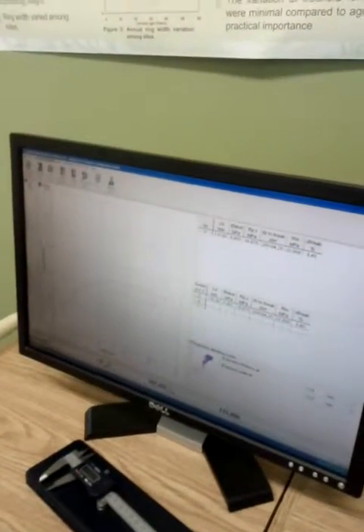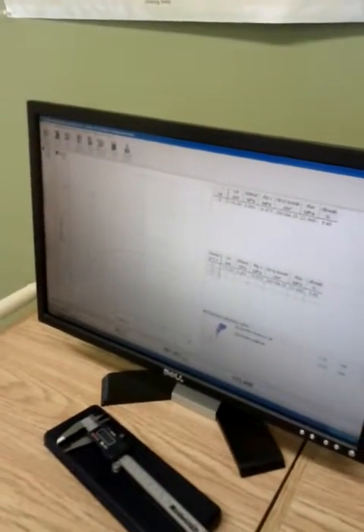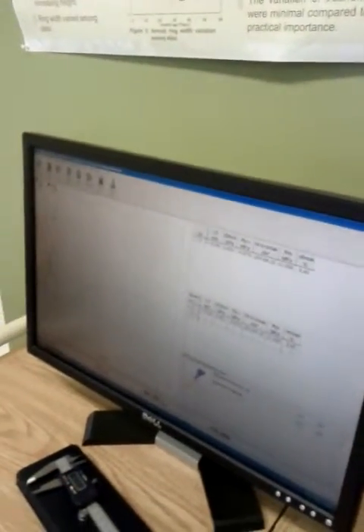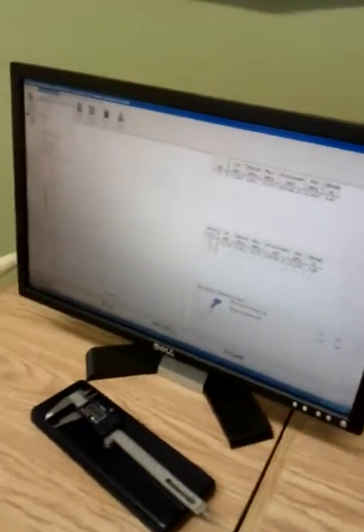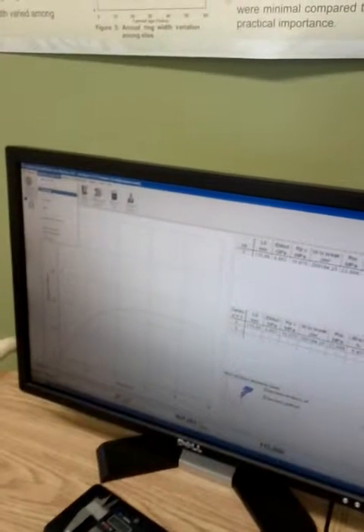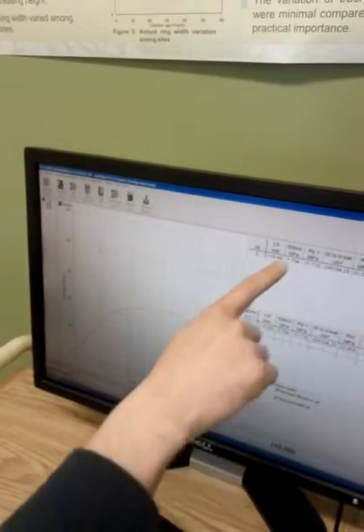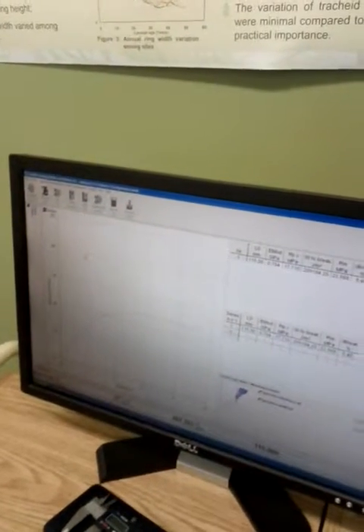Okay, it's done already. Then I have to ask to recalculate with the new values that I set. So now I do evaluate. You'll see it now. It's 0.663, 0.754.